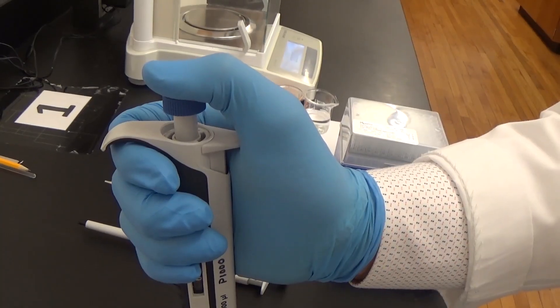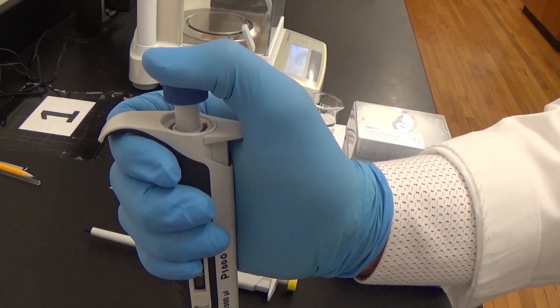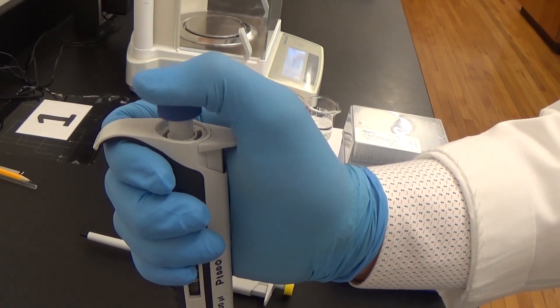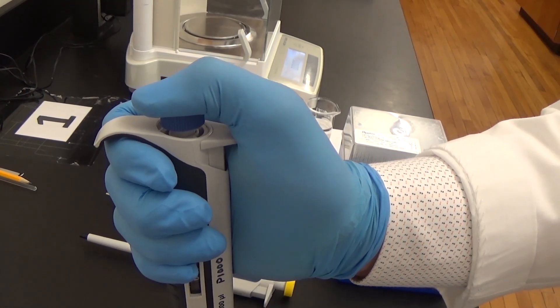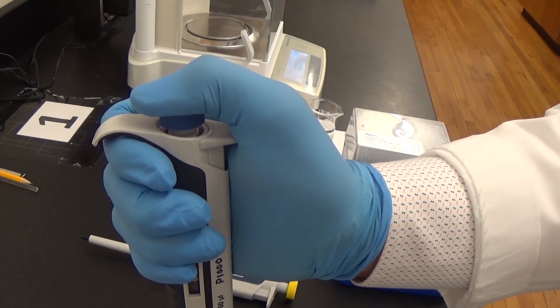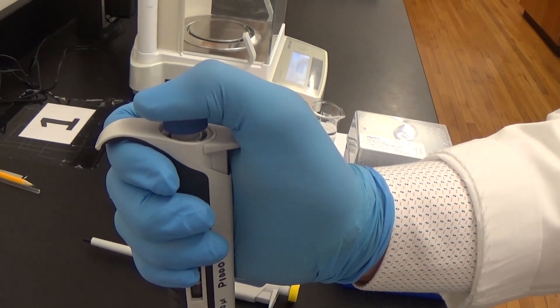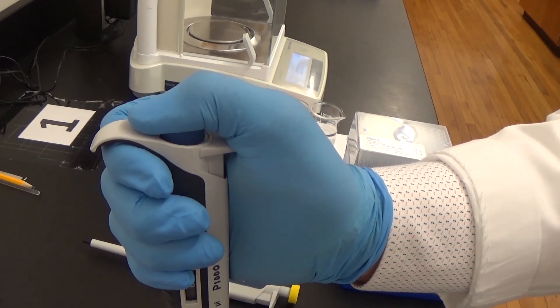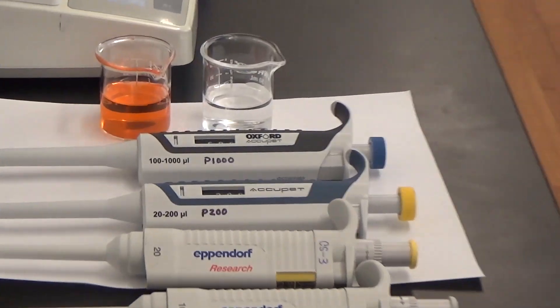The plunger button will stop at two different positions when it is depressed. Push the plunger button down slowly to the first point of resistance. This is the first stop. Then, push the plunger down beyond the initial resistance until it is in contact with the body of the pipette. This is the second stop.